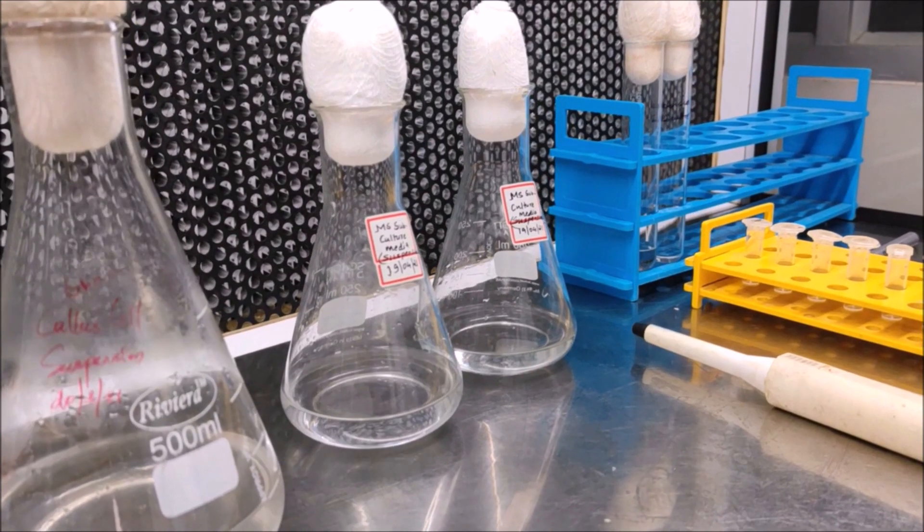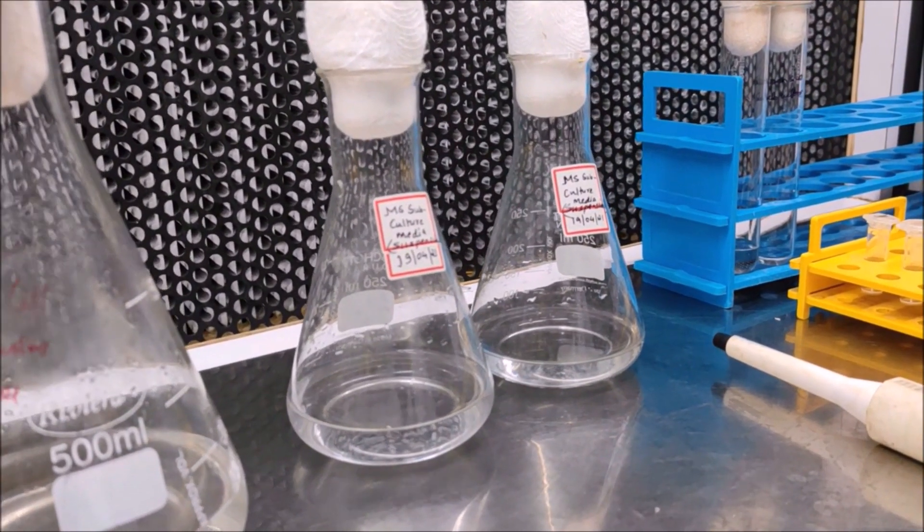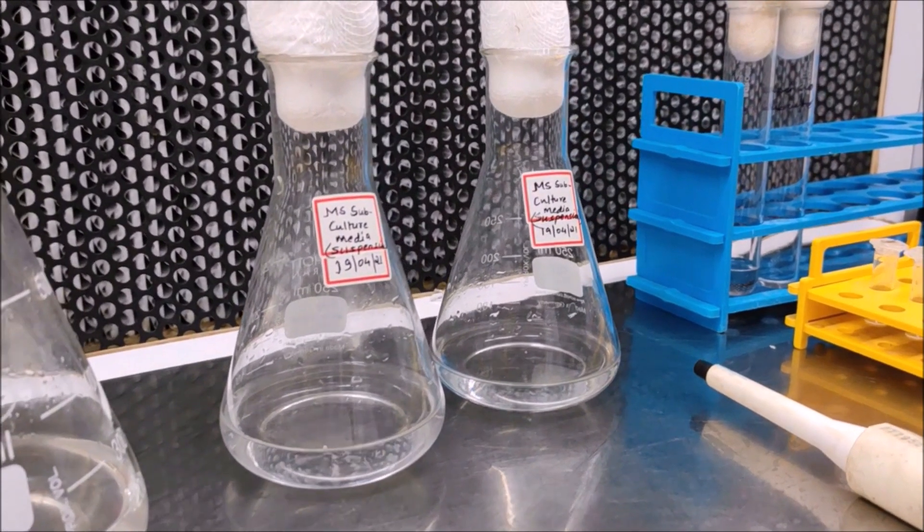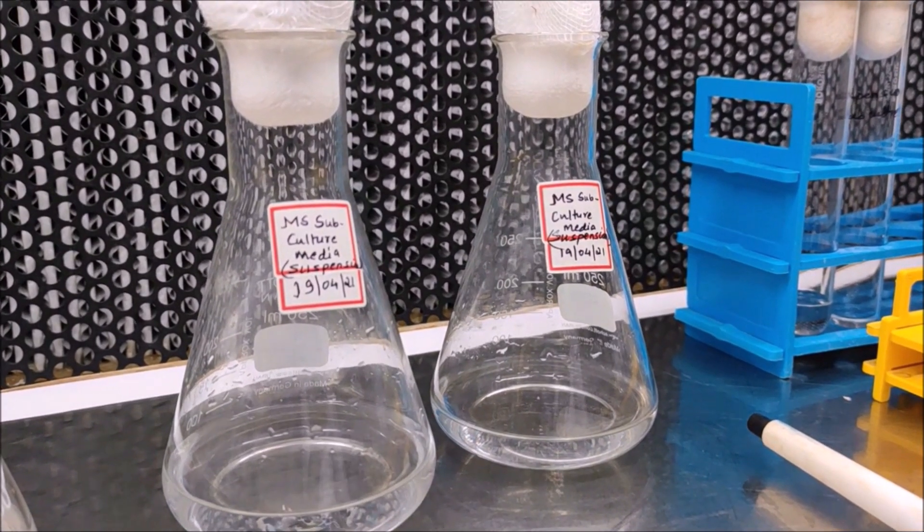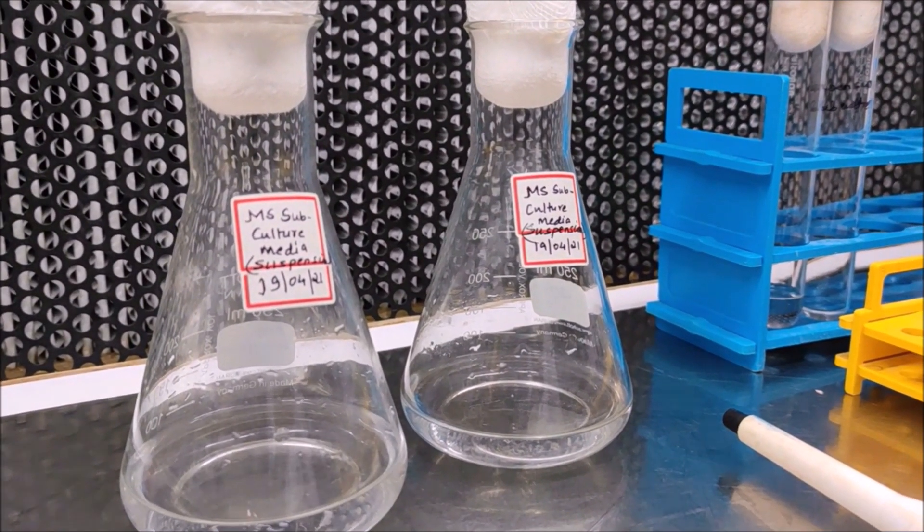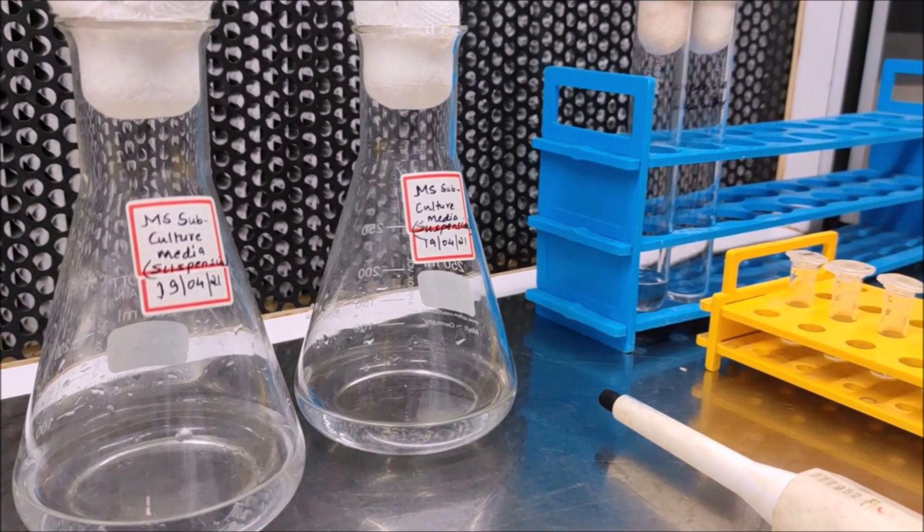Eppendorf tubes for taking cells for determining cell density and viability. New flask with 70 ml fresh sterile liquid medium. Culture tubes for aliquoting the suspension culture and transferring it into the fresh medium.